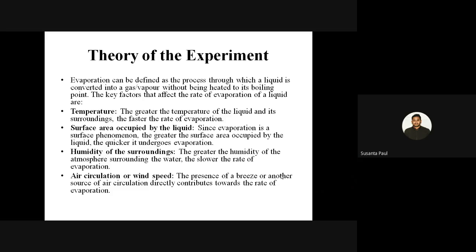Now the next factor is the time of evaporation. So it is a very important parameter. The time and the temperature, these two parameters correlate with each other. Okay, so exposure to a relatively high temperature for a short time may be less destructive to the active ingredient than a lower temperature with exposure for a longer period.